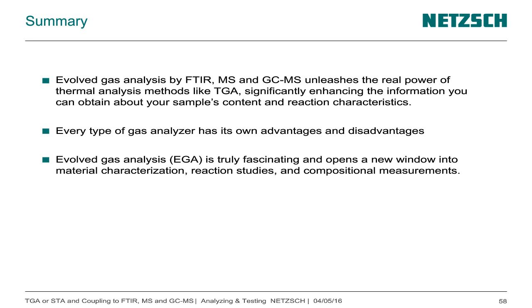So my first GCMS coupling was thermal desorption, because this is the easiest way.